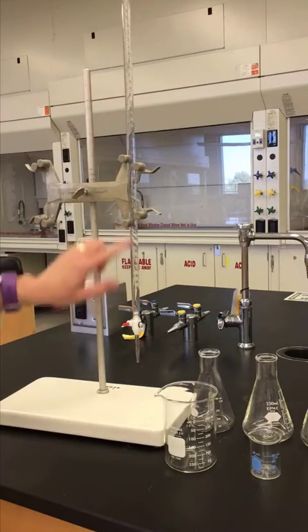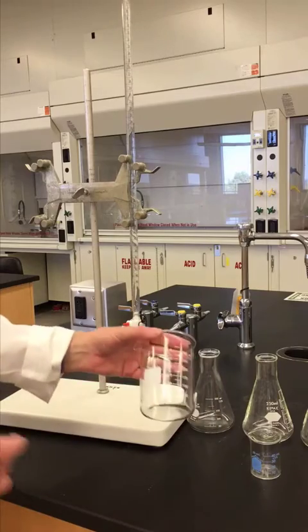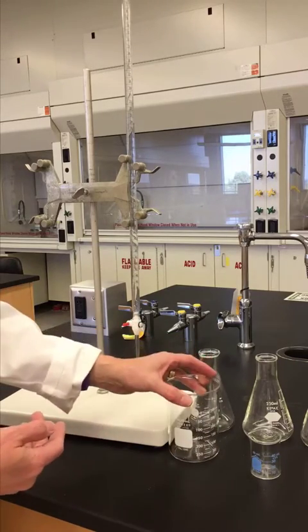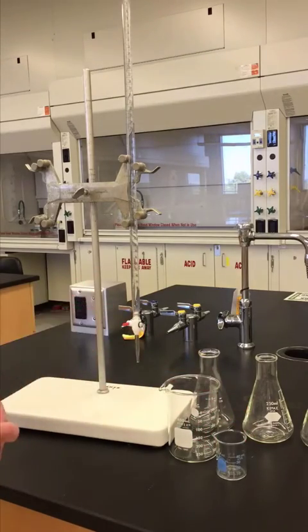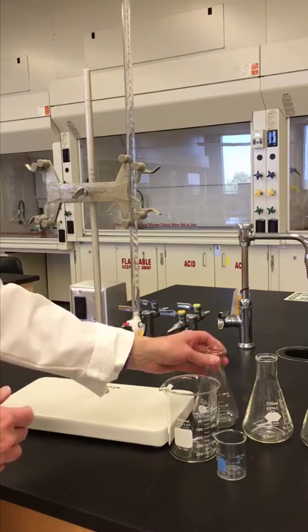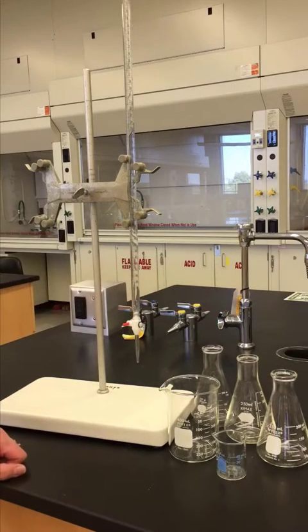We'll look at the burette a little bit closer in a bit. The other equipment that you need will be a large beaker for waste, a smaller beaker to put our base in, and we're going to need three Erlenmeyer flasks for trials one, two, and three.